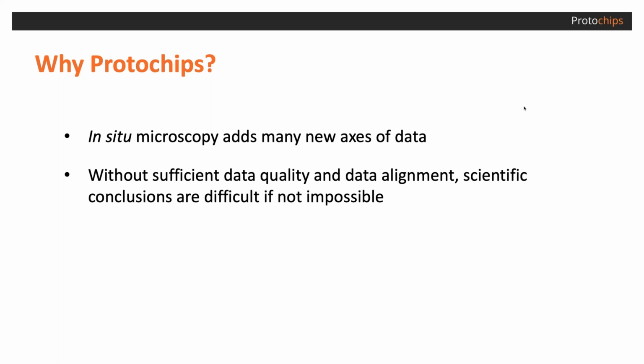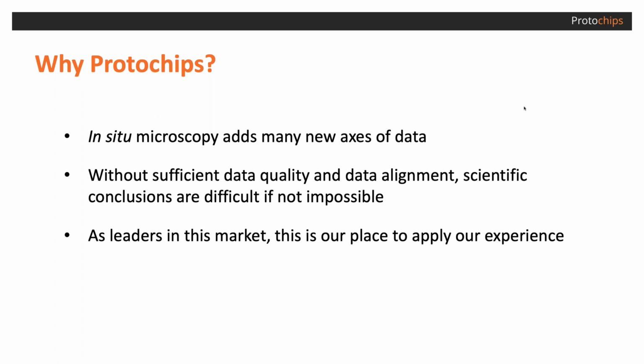Second of all, if the quality of the data and the data synchronization isn't top-notch, scientific conclusions become difficult, if not impossible. And actually, even worse than that, you can draw the wrong conclusions. Cause and effect becomes difficult if everything isn't synchronized. And if something still has some movement or drift to it, it becomes difficult to see certain things in the data that otherwise would jump out at you if nothing was moving. So those things have to be addressed, and they're barriers for our market.